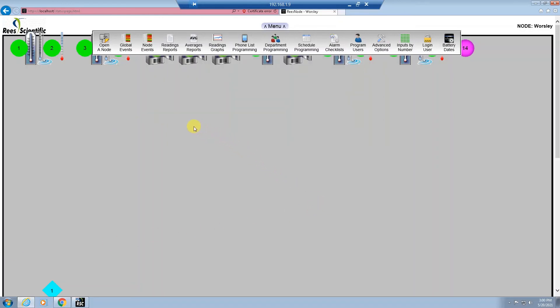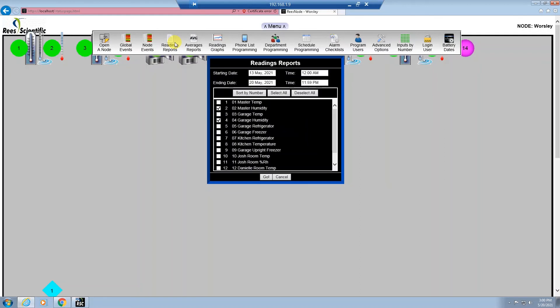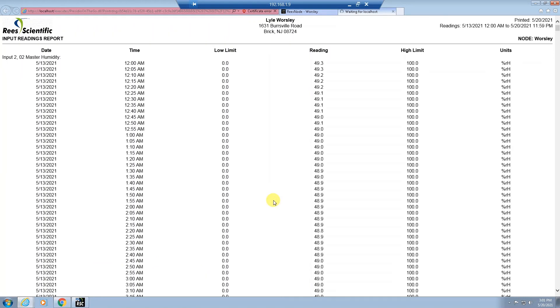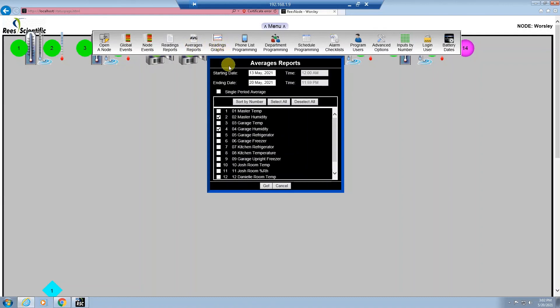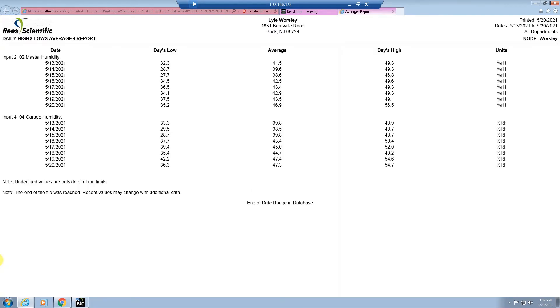Selecting the readings report will give you a choice of printing either a single, multiple, or all inputs in a report. As with other reports, you can change the date range from the default of the last seven days to any date range you would like. After selecting your inputs, hit the go button and the report will then open up in a separate tab. You can scroll down the report to see readings for each input. To print the report, go to file and print or hit Control+P on your keyboard. The average report follows the same procedure as the readings report, except it will give you the low and high reading of the day along with the average reading for the entire day. Select your inputs and hit go and the report will open up in a separate tab.